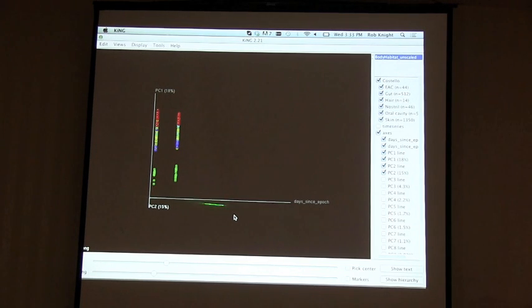But anyway, if I take this and I rotate it around to give you an explicit axis for time, with time you can take any continuous variable metadata category, like time or light intensity or so on, and plot it as an additional axis. With just 4 time points, so these are 2 groups of 2 a day apart, you can't see the 1 day interval.